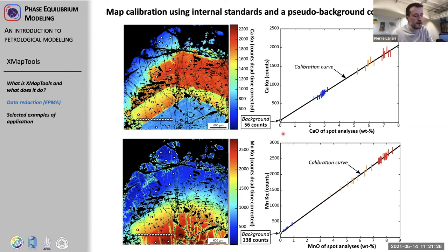And if you do that, if you calibrate everything, for example, all the pixels with this calibration curve, you introduce at least 5% difference on your total, I would say. It's at least 5%. Okay, great. Thanks. I think that answers that, Pierre.